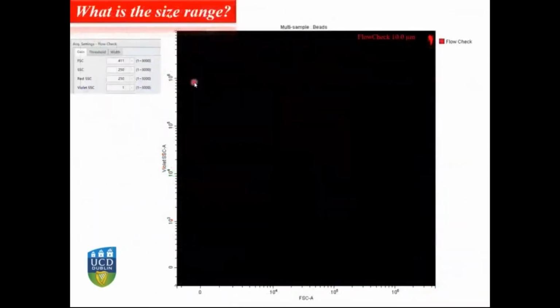Really nice application. And as I said, one of the things I like about the Accuri, and especially on the CytoFLEX, is this large dynamic range, because it allows me to work with different cell lines, and the user doesn't have to move too many things. They don't need to manipulate too much the position of the voltage, in this case the gains of forward and side scatter.